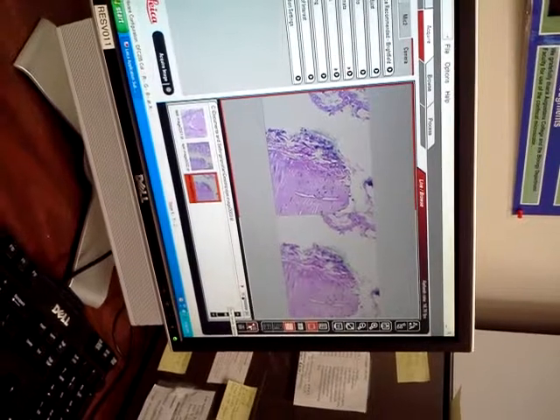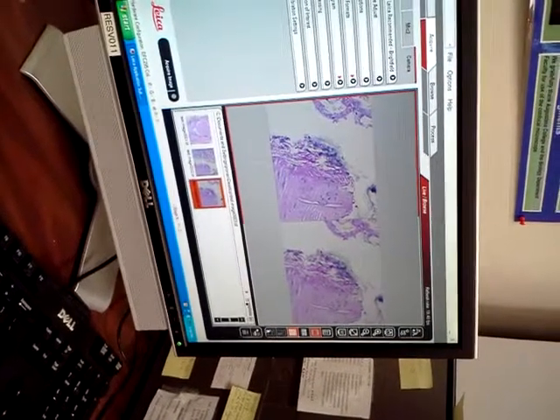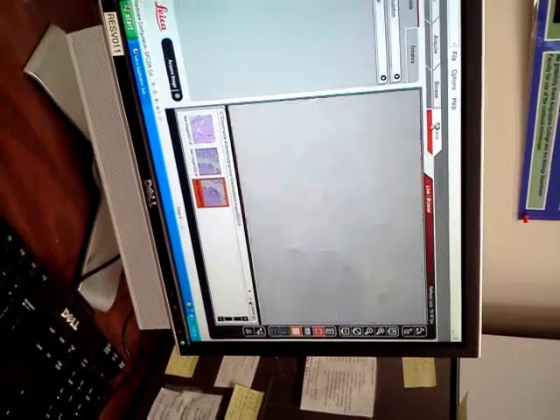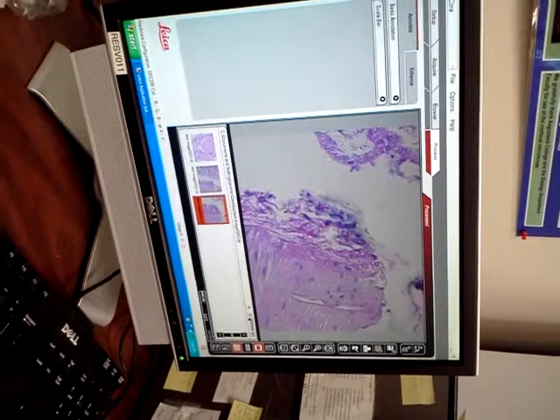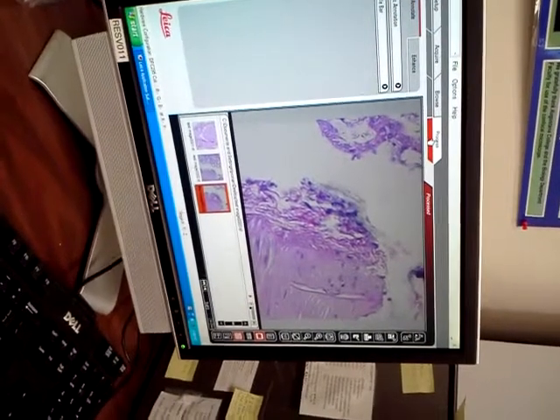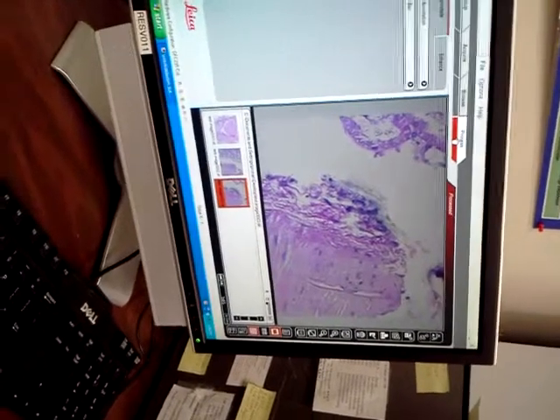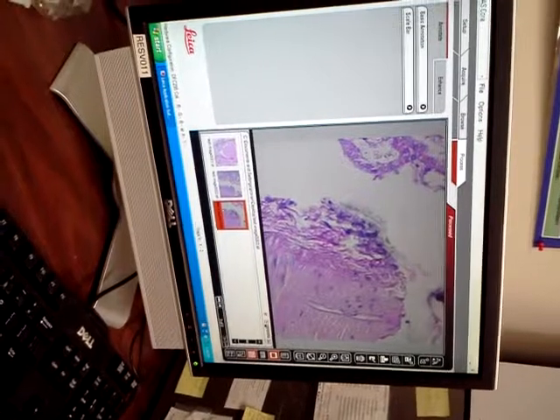Yeah, so this should show up. But you see, this is right below this double check mark box and Process. I went back to Process rather than Acquire. Process lets me do two captured images, and then you could save that as one scroll image. There should be a way to scroll down to that. That's what I'm trying to figure out somewhere.